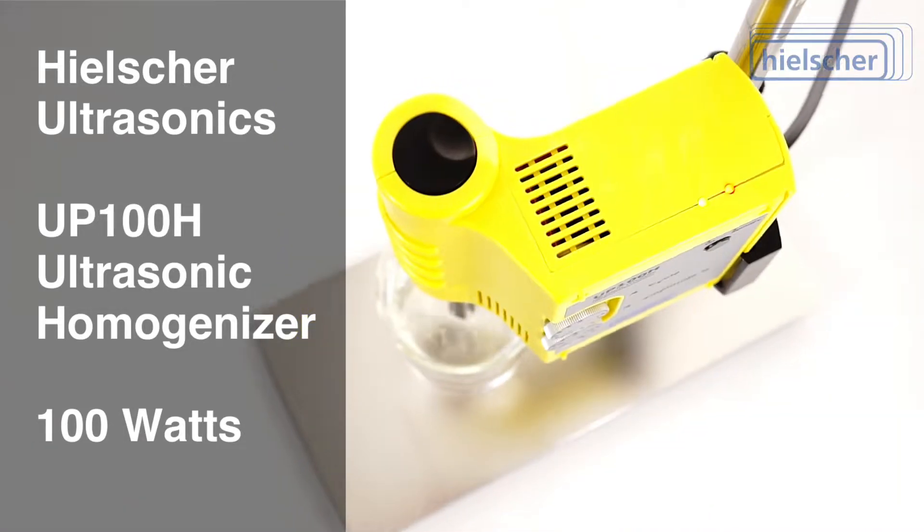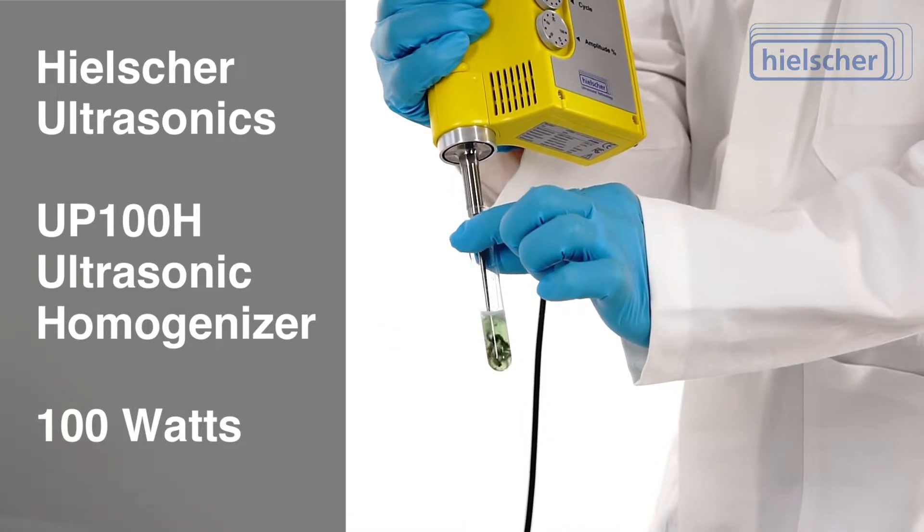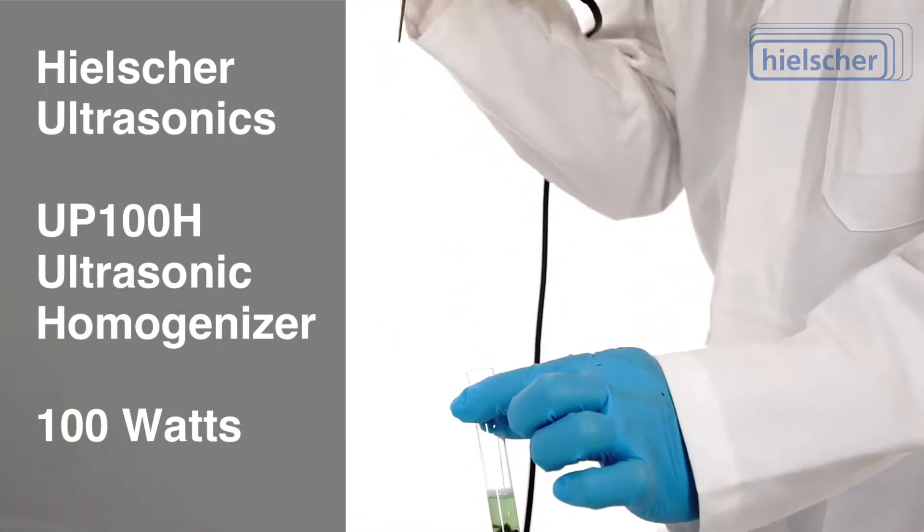The Hielscher UP100H Ultrasonic Homogenizer. Compact, easy to handle, versatile applications, reliable results.